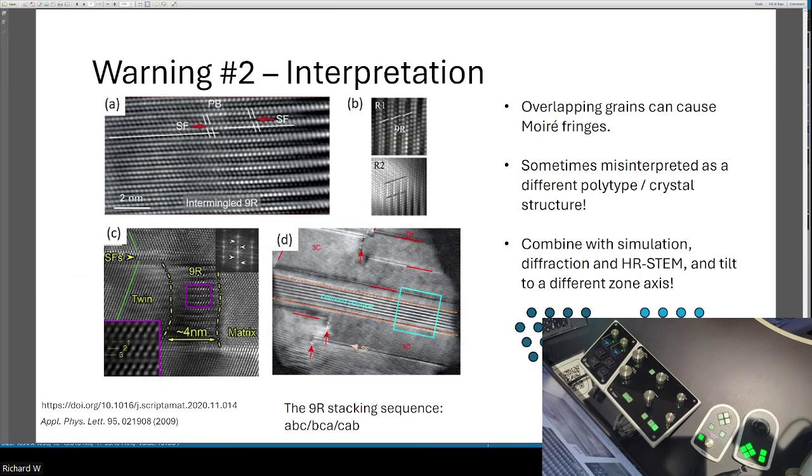It can be useful to image the sample in 2 different orientations. Here we're oriented to the 100 orientation. That's going to give you some information about the lattice from that orientation. Tilting to another orientation, such as the 110, which is going to be 45 degrees of tilt, is going to be challenging depending on which pole piece you have.